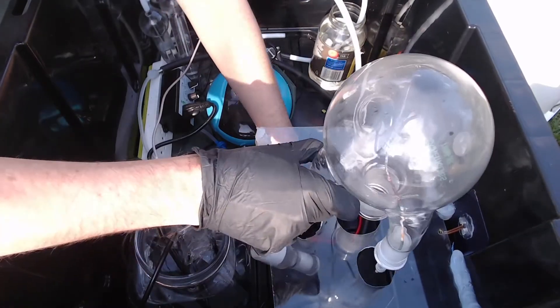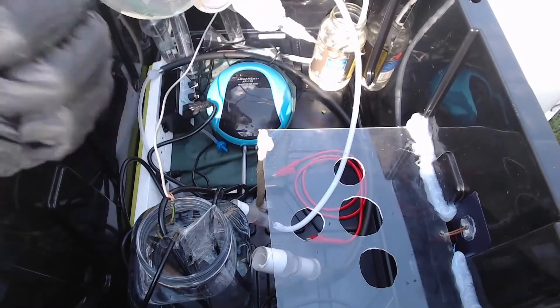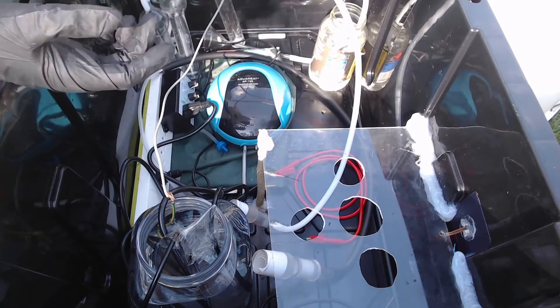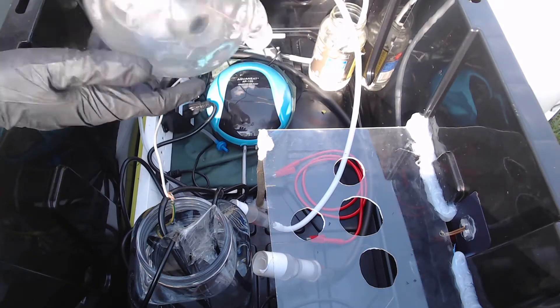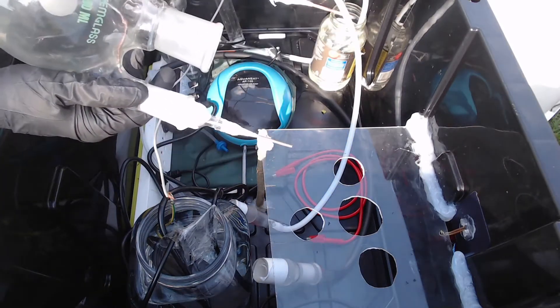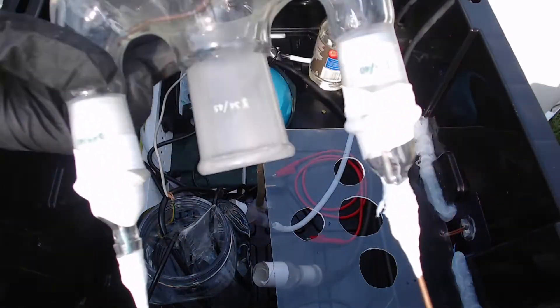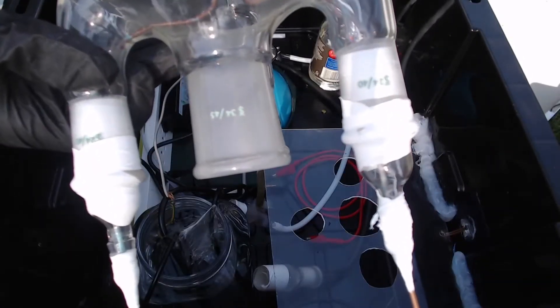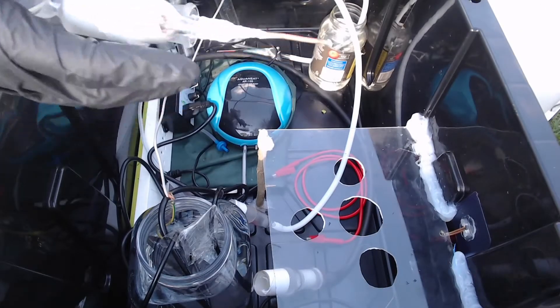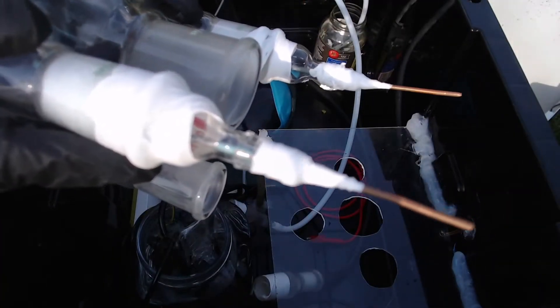Here we've got our reaction vessel — a four-neck round bottom flask. Three of the necks are 24/40s, and one of them is a 34/45. There are also a couple of inert gas adapters in there. We run the electrodes in through those.